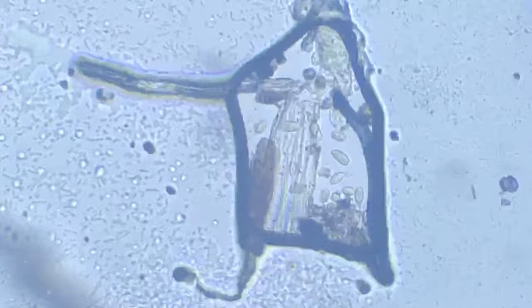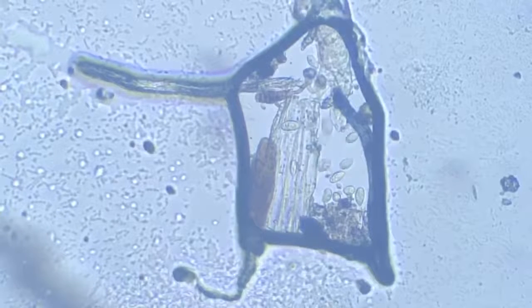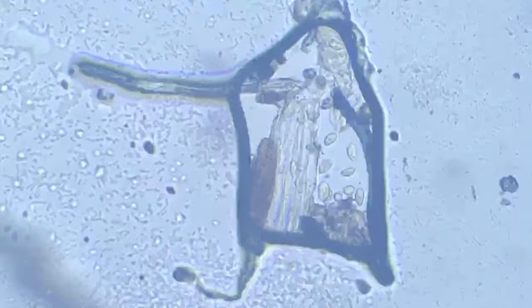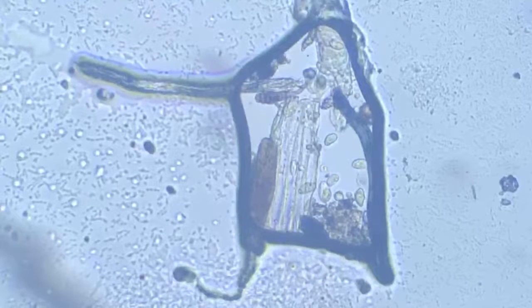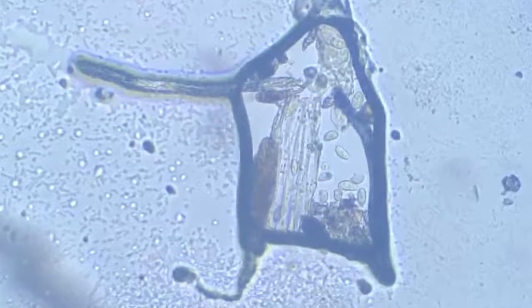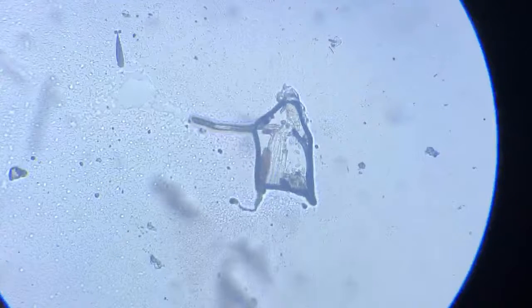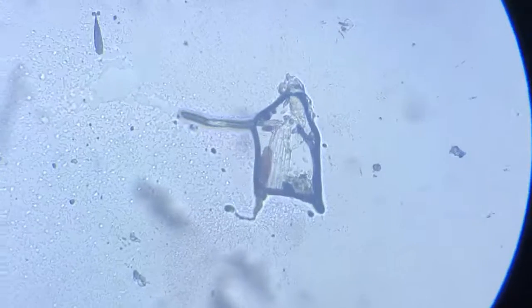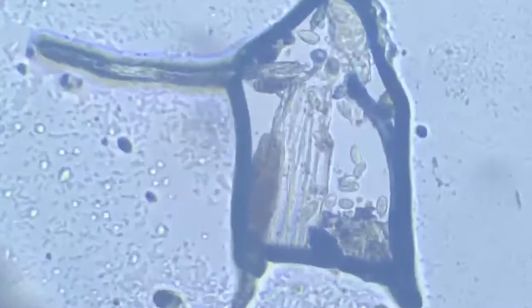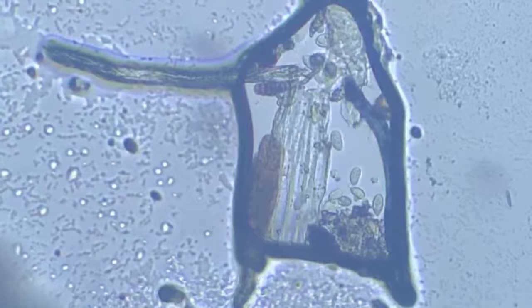These small animalcules have been trapped in a small air bubble, a little bit of water bubble rather to say, and they are struggling for existence. This is the situation. The water from the slide has evaporated, leaving just a trapezium of water droplet, sufficient for just a few more minutes of survival for these little animals who are struggling to live.